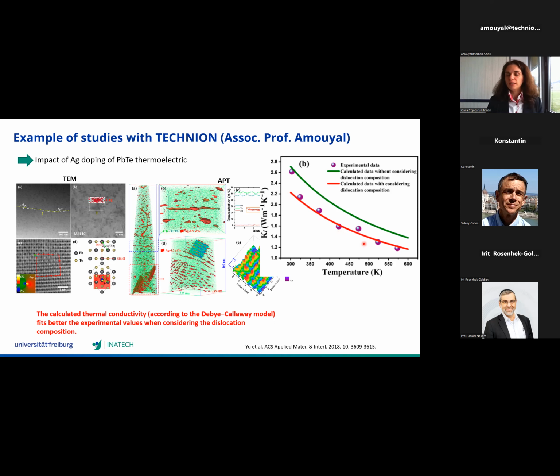So you see already that the atom probe tomography results are really very useful also for theory, because it gives you hints about what happens down to the nanometer level. And if the proportion of this mechanism or effect is strong, then it will strongly change also your simulations or your calculations that you have applied for a specific material.